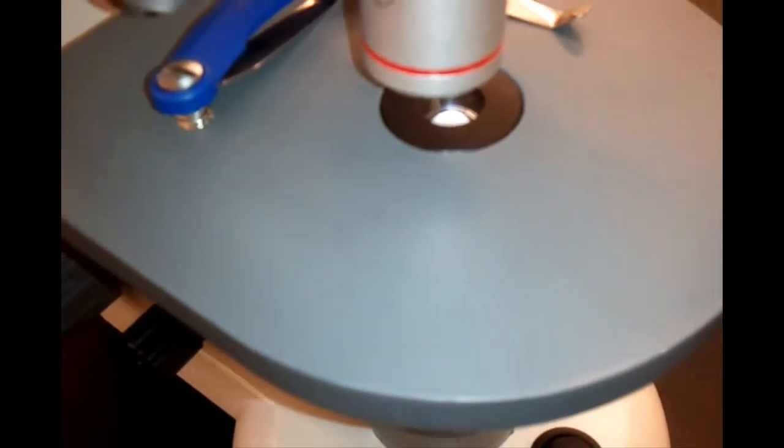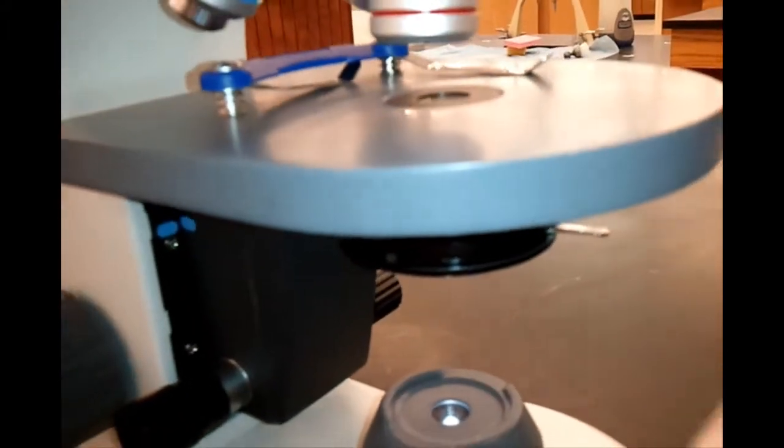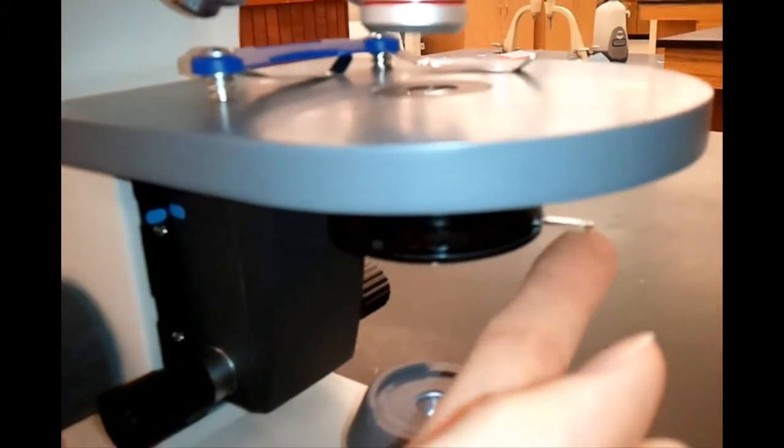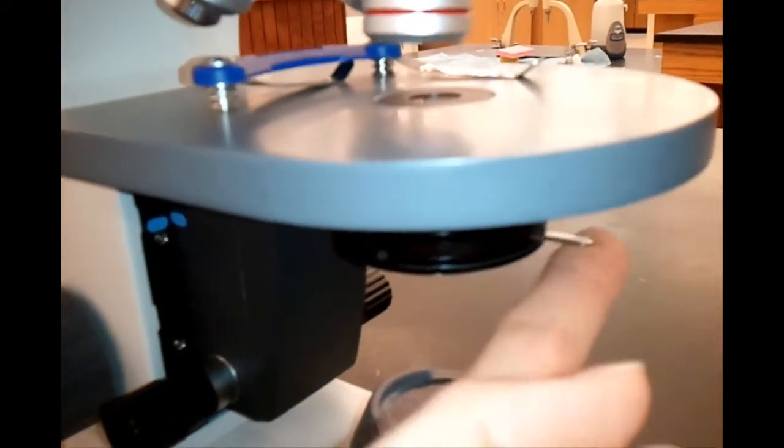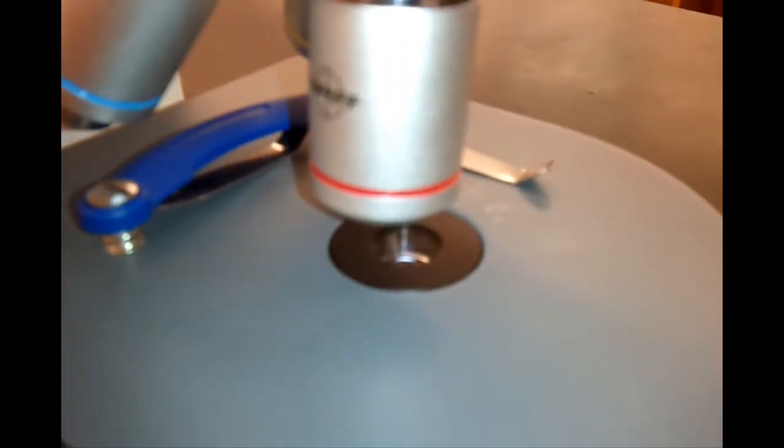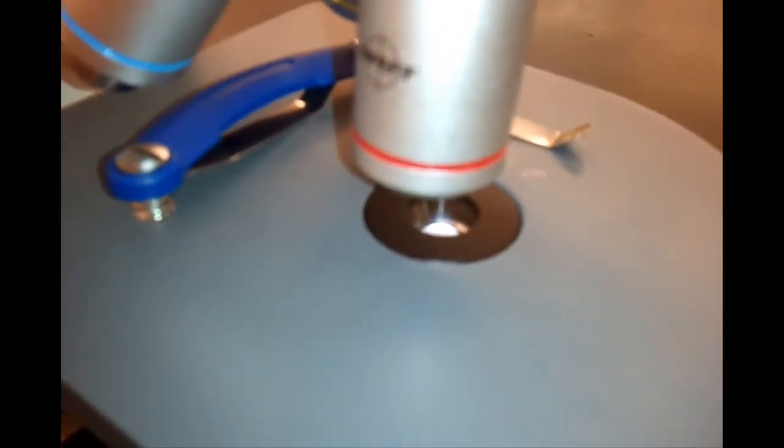The light travels through an opening in the stage. The amount of light is controlled by a small lever underneath the stage called a diaphragm. This microscope has an iris-type diaphragm that functions like the iris of your eye.